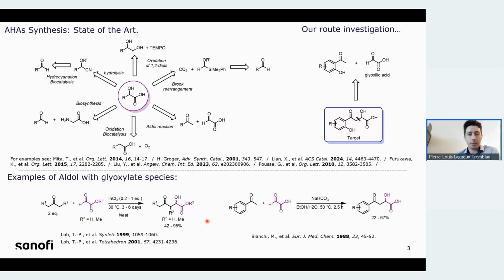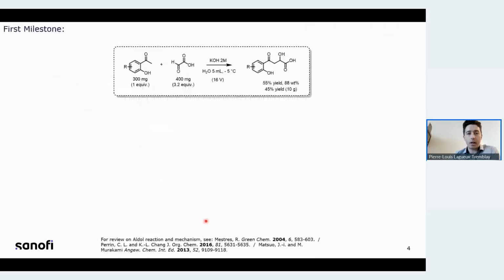To really understand the kinetics of those transformations. Just as an example, this is an Aldol reaction we're trying to perform here, and this transformation didn't work particularly well using, for example, a base in water. So while the conditions are very attractive, because you're essentially conducting organic synthesis in very benign solvents and using very simple reagents, the yield of those transformations was fairly low. And once you were about to scale up those transformations, the performance of the reaction itself was even going down.